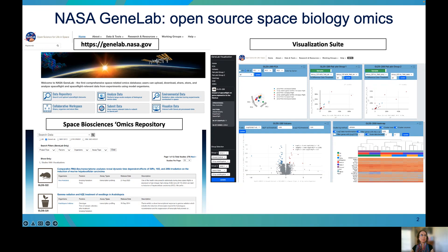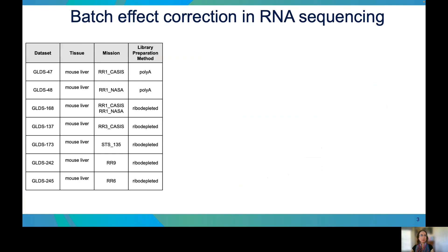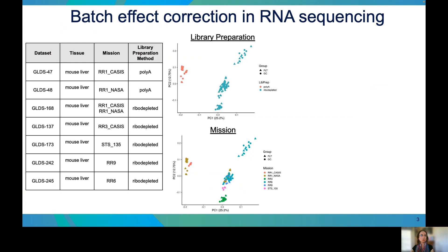Our current work focuses on understanding and mitigating technical batch effects in a specific type of space omics data: RNA sequencing. To better understand the presence of batch effects in space biological RNA sequencing data, we combined seven GeneLab RNA sequencing datasets from space-flown and ground-controlled mouse liver. These datasets come from experiments flown on several different flight missions, and the RNA sequencing libraries were prepared with two different library preparation methods: polyadenylation and ribo-depletion. We highlight these two technical factors because after a review of PCA plots, we found that they contribute most strongly to batch effects in the combined datasets.